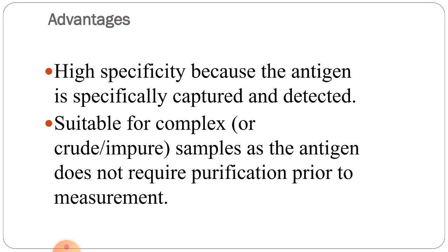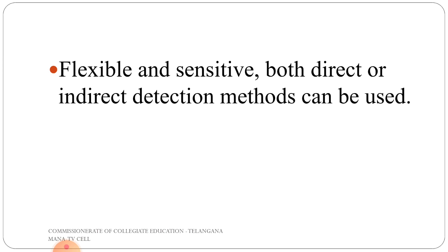High specificity, because the antigen is specifically captured and detected. It is suitable for complex or crude samples, as the antigen does not require purification prior to the measurement. It is flexible and sensitive. Both the direct and indirect detection methods can be used.